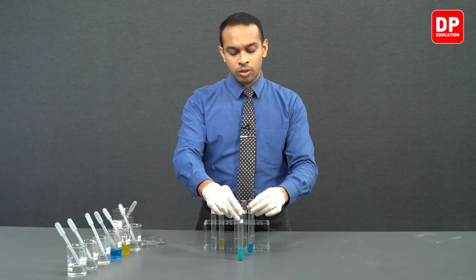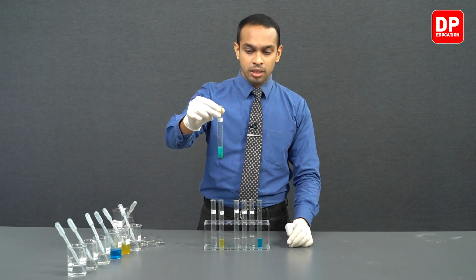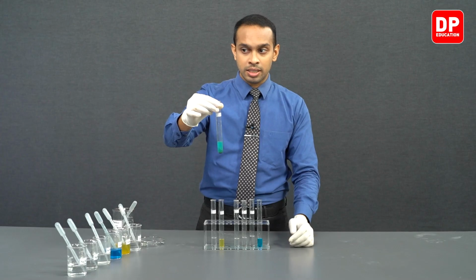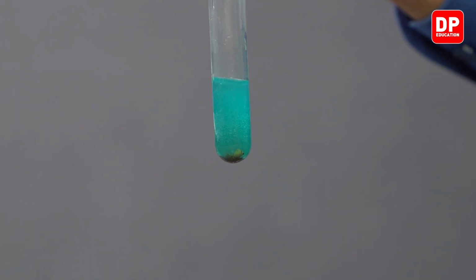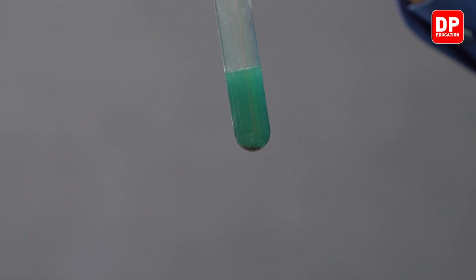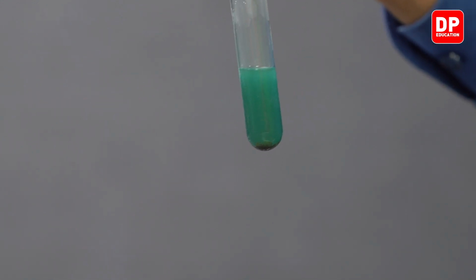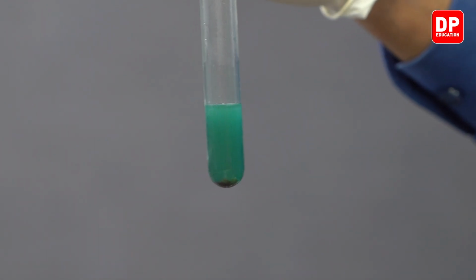The copper sulfate that was added with the lead metal has a brown color precipitate at the bottom. You can observe it when you mix the solution a little bit. You can see that there is a brown color precipitate at the bottom of the copper sulfate solution.